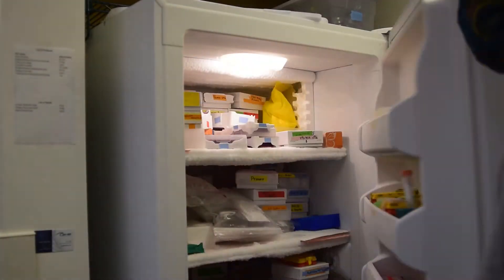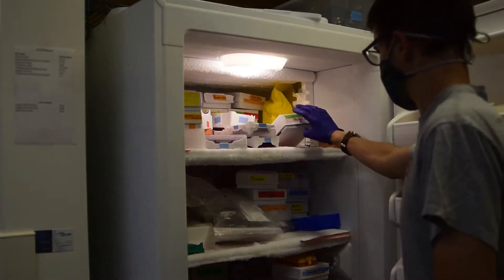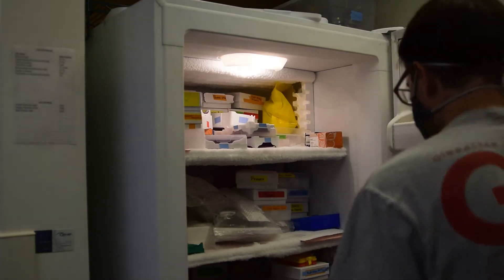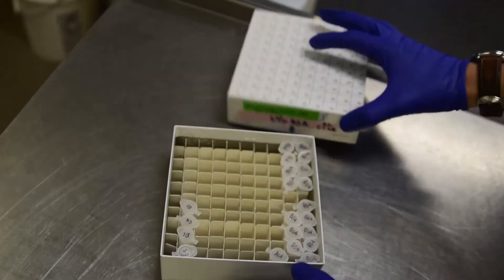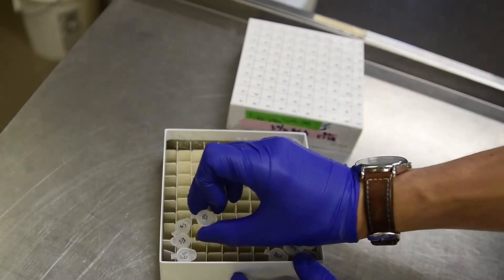You will need to retrieve two reagents from the freezer: labeled ES for extraction solution, and BSA for bovine serum albumin, which is the 3% solution. You can let the BSA sit at room temperature until you use it. You may keep these in your own freezer box.